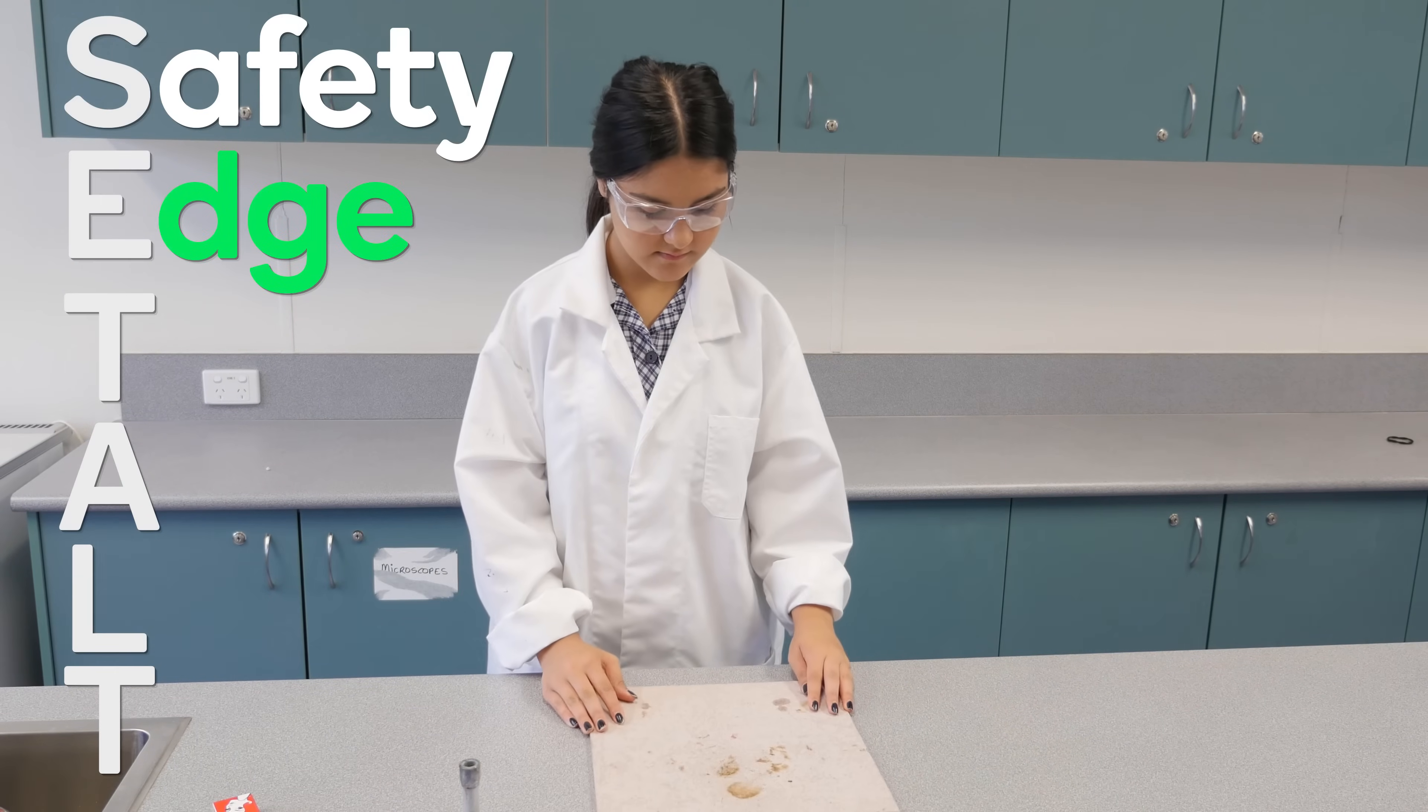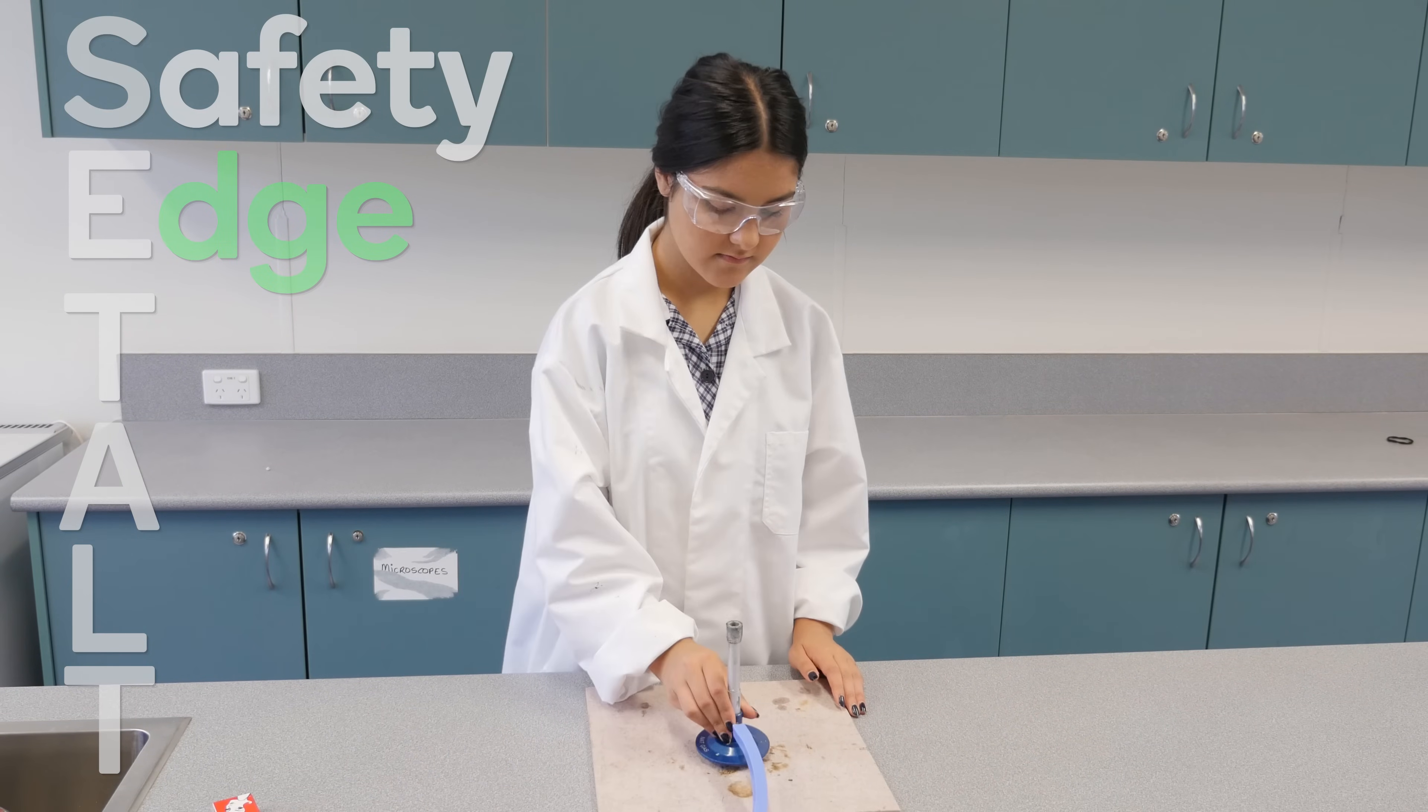E is for edge. Place the burner on a heatproof mat a safe distance from the edge of the bench.